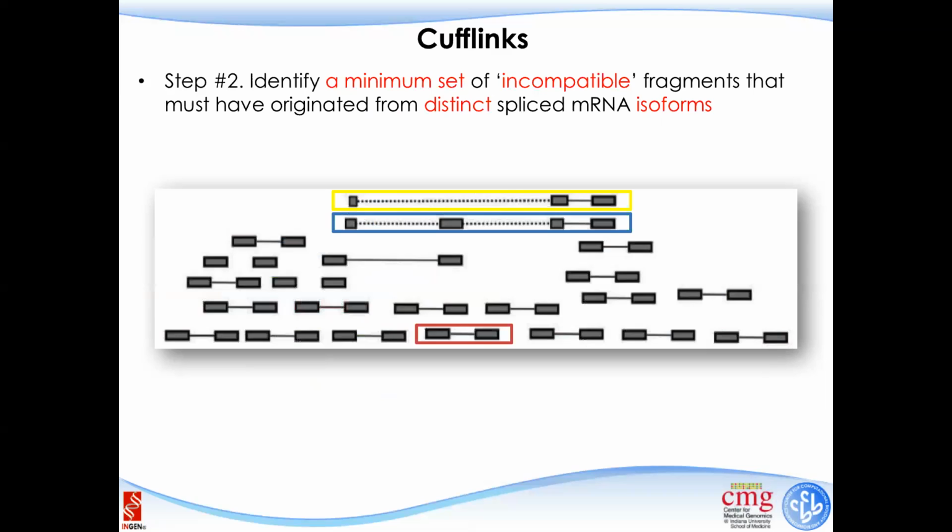But the problem here is that if our observation is that we have reads mapped to the first exon, reads mapped to the second exon, and reads mapped to the junction region, what is the truth? The transcript with the first and second exon is definitely there, but we are not sure if the transcript with only the first exon or only the second exon is there. If the number of exons increases and there are too many possible alternative splicing isoforms, there will be more uncertainty.